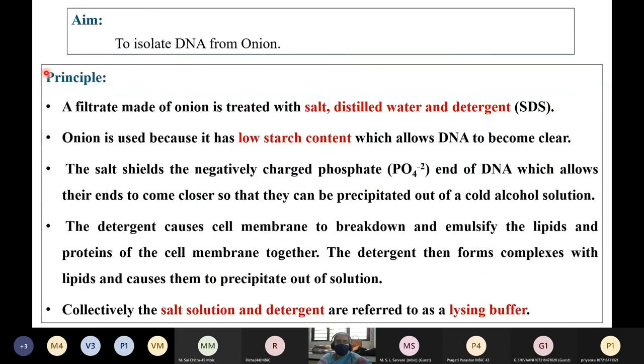The basic principle of isolation is to extract the DNA from onion. A filtrate made from onion is treated with salt, that is sodium chloride, water, and a detergent. The detergent used is SDS, that is sodium dodecyl sulfate. Onion is used because it has low starch content, which allows the DNA to become clearly visible when isolating it. The sodium chloride shields the negatively charged phosphate groups on the DNA, allowing the ends of these phosphate groups to come closer so they can be precipitated out of the cold alcohol solution.